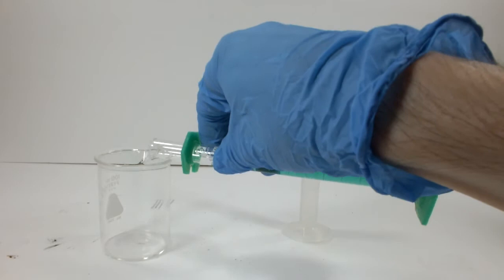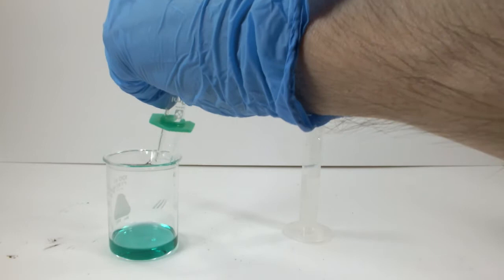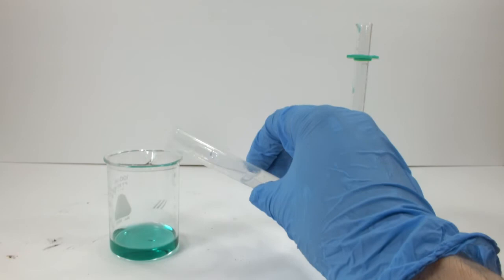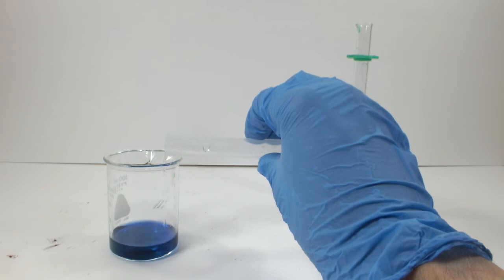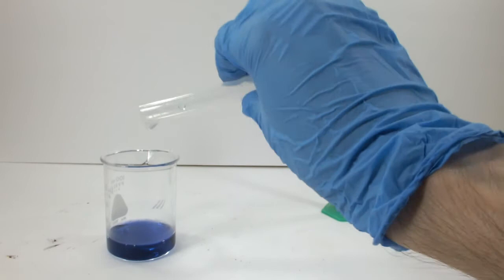While I'm at it, I'm going to make the sulfate complex too. Here are 10 milliliters of 1 molar nickel sulfate solution. I'm going to add an excess of concentrated 14.3 molar ammonia solution, and right away you can see this deep royal blue color develop.